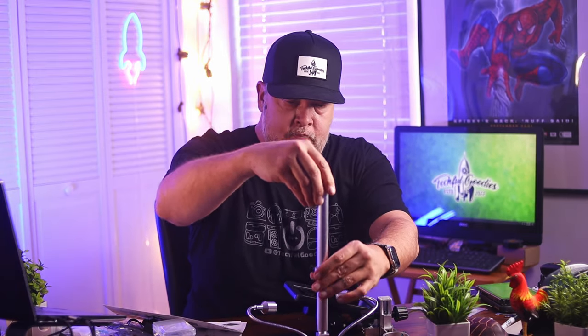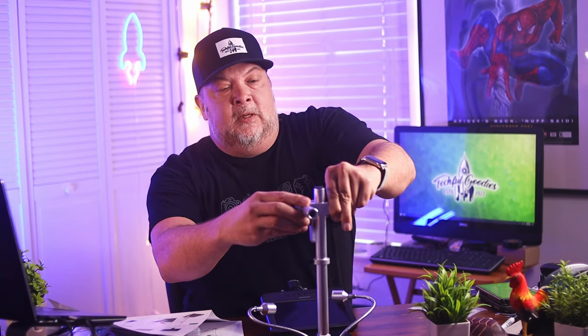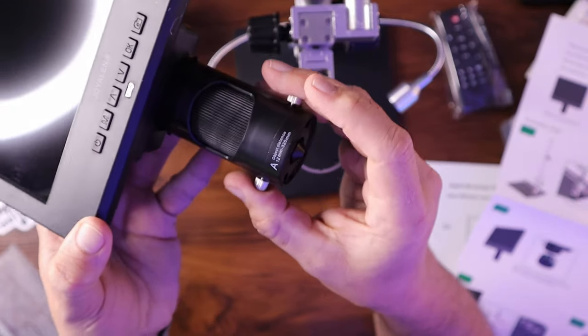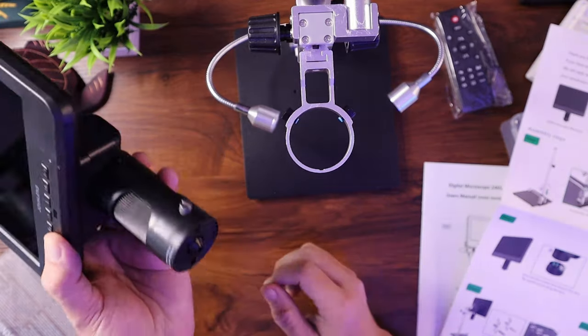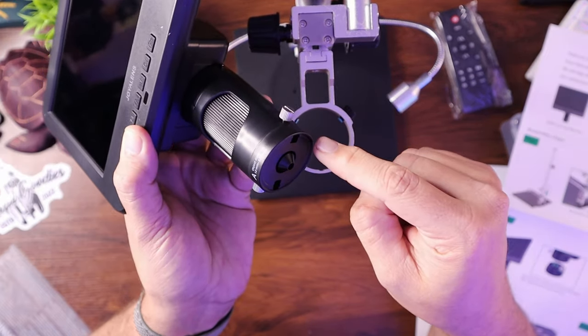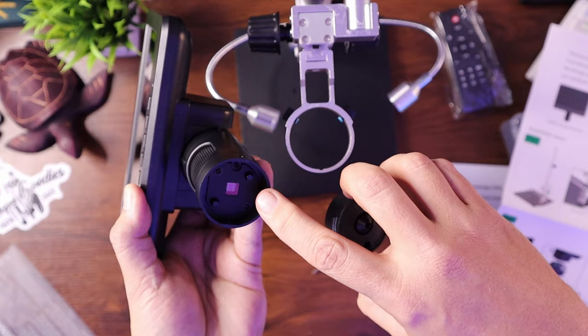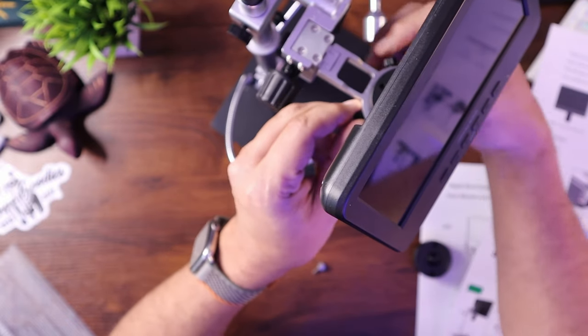Step one: screw this into here. Step two: slide this over the top and tighten it down. This is basically your arm that holds the magnifier and screen. An interesting thing about this product is that the magnifier is connected directly to the screen — this is your main unit, and everything else is supporting it. I'll go ahead and take this lens off to connect it to the main housing. You can see the main lens receiver is on the inside, so this just plops down into the unit itself.